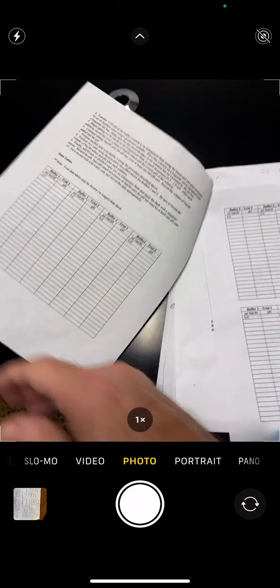It's important in our blood. Our blood pH is 7.4, which is slightly basic. 7.0 is neutral. We have many buffers in our blood, even the carbon dioxide that we exhale. When it builds up, it becomes carbonic acid, combines with water. So buffers are important in living systems. In order for our enzymes in our body to function normally, we have to maintain a certain pH in our blood. Okay, so let's collect data.